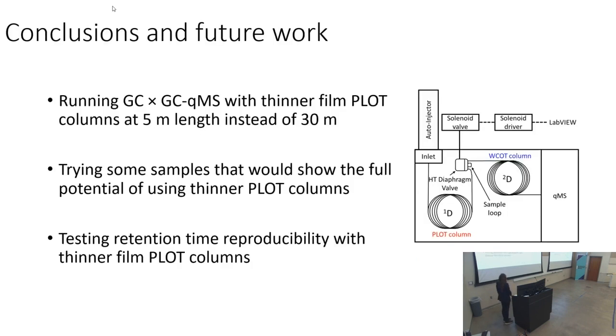And so with that, we're still working on running the 5 meter separations on this, trying some new samples, and we still are in the process of testing out the retention time reproducibility with these new columns as they are custom made. So we want to make sure that they are actually performing the same every single time.